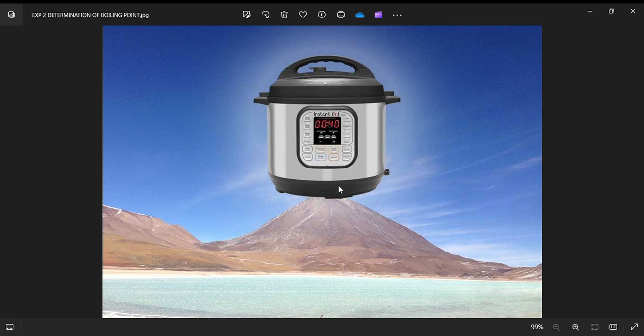If the boiling point you record falls within the stated boiling point, then you know that boiling point is indicating a particular organic substance which you should give. Now, question 3 is the bone of contention. Even though it's just 1 mark, at the same time, we need to know it, because if you don't understand this setting, you may not be able to answer this question correctly, and at the end you discover that by the time you are giving your answer, you'll be contradicting yourself. So you need some good explanation.